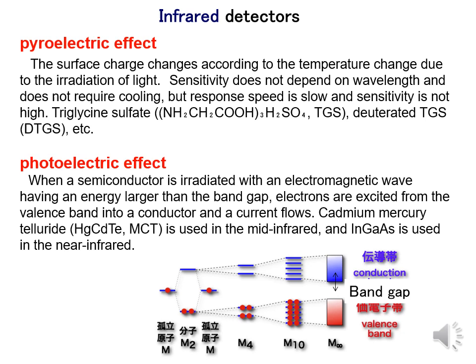In principle, it is the same as solar cells and silicon photodiodes. Silicon is excited by light with a shorter wavelength than visible light, but it is not excited by infrared light because it has lower energy than the band gap. To be used as an infrared light detector, it must be excited by infrared light.